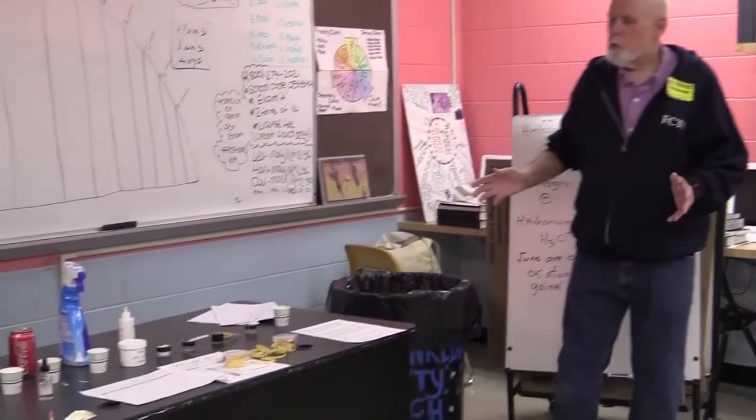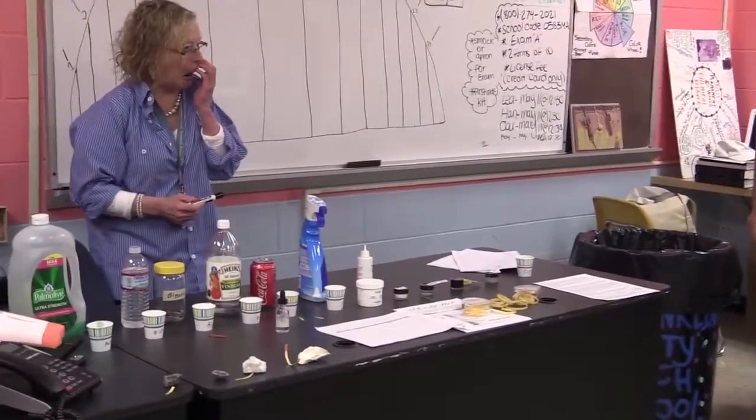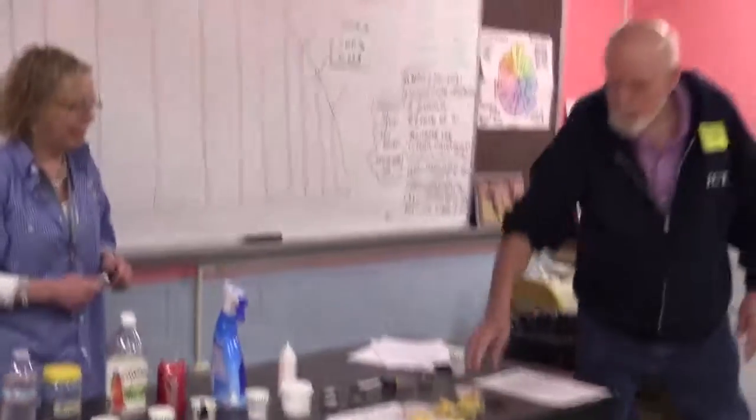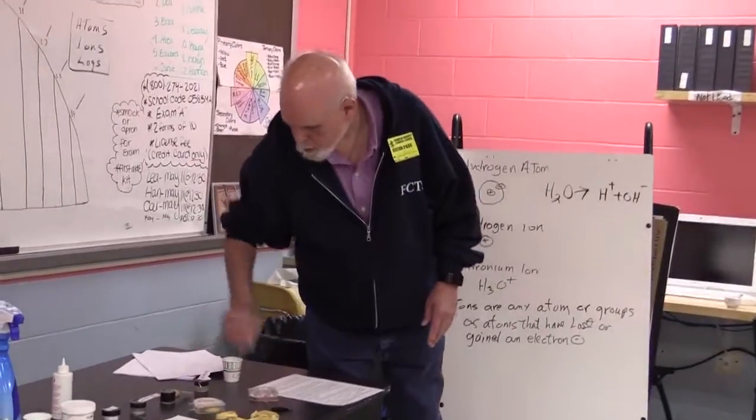So, do you want to have students come up? They can each take a strip and go around and test things and take your readings. All right, so there's a strip of pH paper here, and come on up. If you need more, I'll put some out.